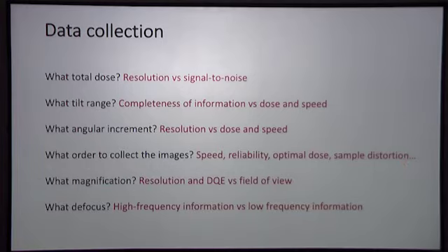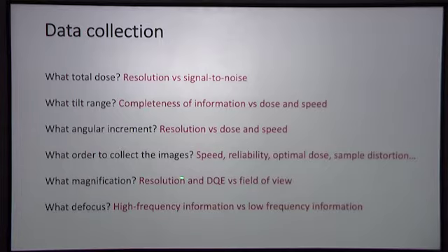What magnification should we collect our data at? Obviously, there is some resolution limit set by the pixel size. So if we work at higher magnification, we can go to higher resolution before we're affected by Nyquist. If we use a higher magnification, we have a lower field of view, so we're seeing less interesting things.